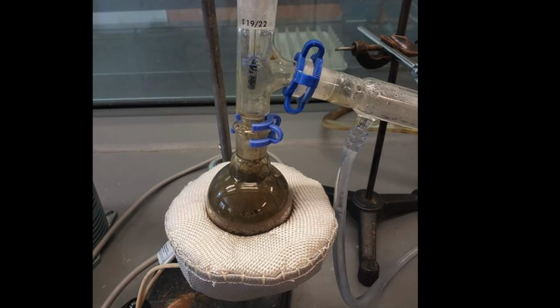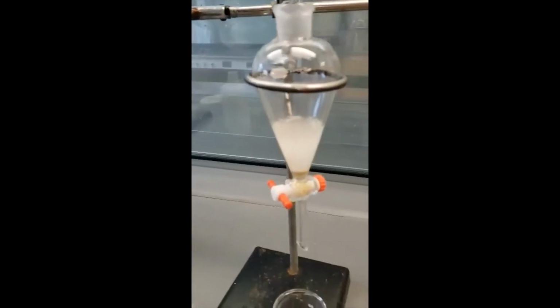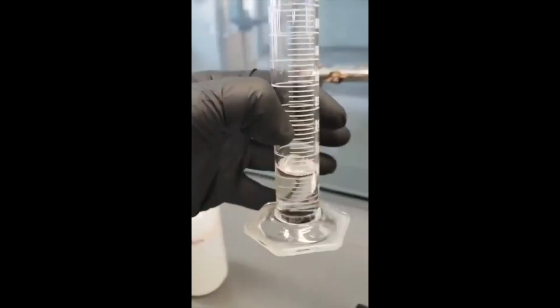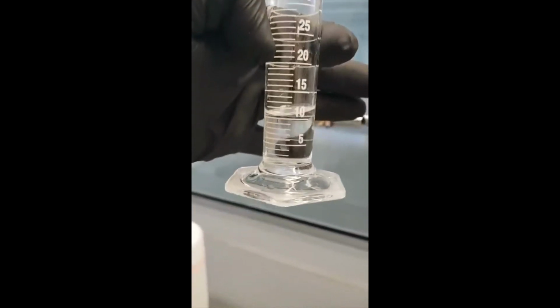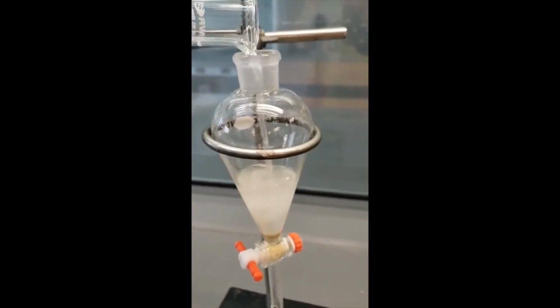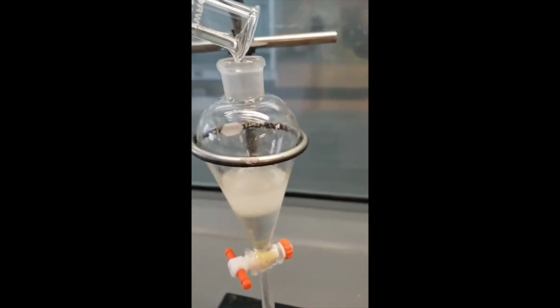Once you've collected your distillate, turn off the variac and heating mantle and turn off the water. All spice waste should be put into the proper waste container in the hood, not in the sink. And then transfer your distillate into a small separatory funnel and extract with 10 milliliters of dichloromethane. If your 2 layers fail to separate, you can add 2 milliliters of saturated NaCl and swirl gently.